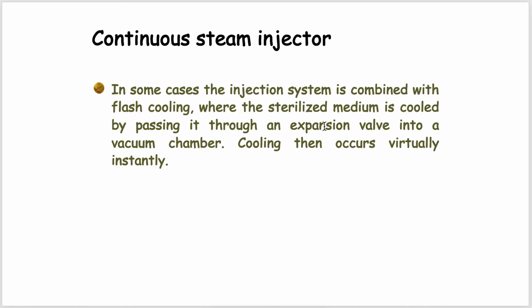Like all the other sterilization processes, cooling is also required in this case. If we sterilize our media by using a continuous steam injector, we need to cool the media after the sterilization is done. And for doing so, in some cases the injection system is combined with flash cooling, where the sterilized media is cooled by passing it through an expansion valve into a vacuum chamber. Cooling then occurs virtually instantly.